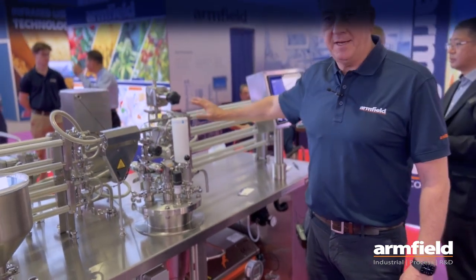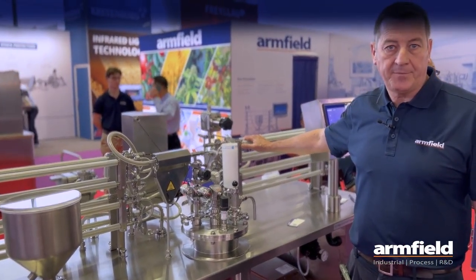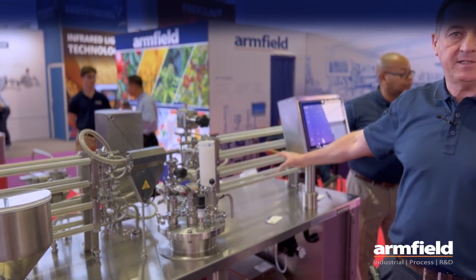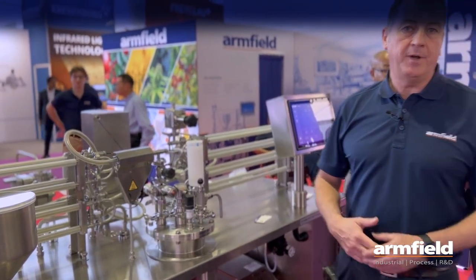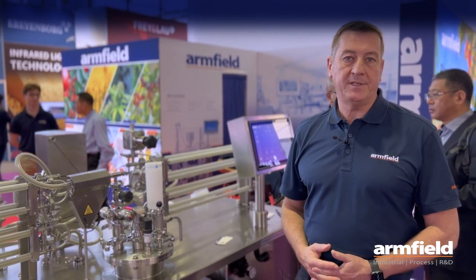From there you would then go back to your cooling section for two-stage cooling. You then exit the system, and you have the option to go to an Armfield FT83 sterile filler to give you products with extended shelf life.